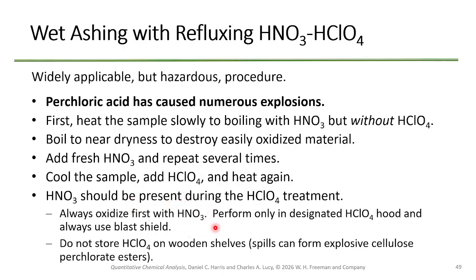So you always oxidize first with nitric so you can get as much done without using the perchloric as possible. Yeah. And then you use perchloric to finish it up with a blast shield and hood.